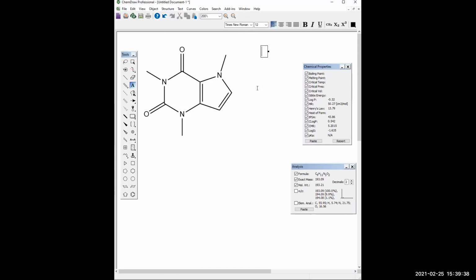One thing I will touch on now is when you see structures a lot of times in the literature or in a textbook, you'll often see these different elements labeled with a particular color, right? Like nitrogen might be blue, your oxygen might be red, it might be in a different font, it might be emphasized.